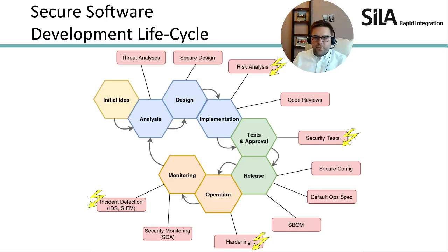So there are two things here. The first one is you would want to close those doors, close those connections at all, and you also want to have a baseline that you can monitor for. And another thing when you do a release is, when you release your software, you're having a defined version with all the dependencies, all the third-party software products inside. So make sure you have a software bill of materials where you know all the versions of all the pieces of third-party software you have in there, because this is a way of getting vulnerabilities into your software. Vulnerabilities are detected in all kinds of software all the time. We will get to that in a second.